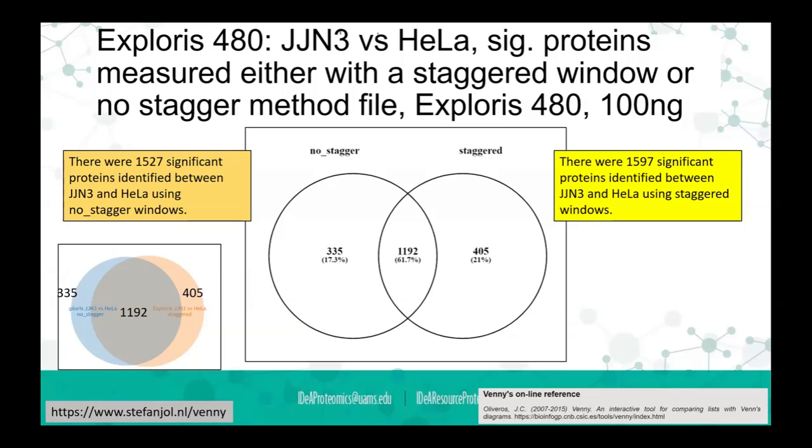How are the staggered spectra deconvolved? I don't know that they were. Oh, okay. So how do you mean? Explain that term. Yeah, the whole idea of the staggered workflow is that you have overlapping regions in your buckets that can be virtually deconvolved, which normally happens in MSConvert. They have a demultiplexing option, but if that doesn't happen, then effectively it's not really a staggered workflow; it's an overlapping workflow.